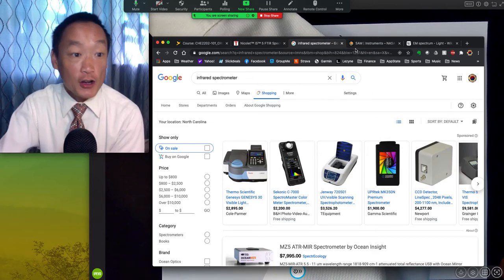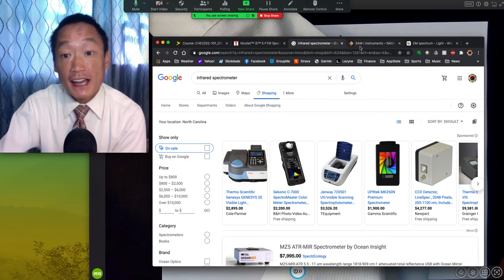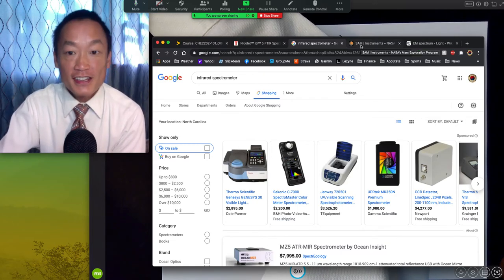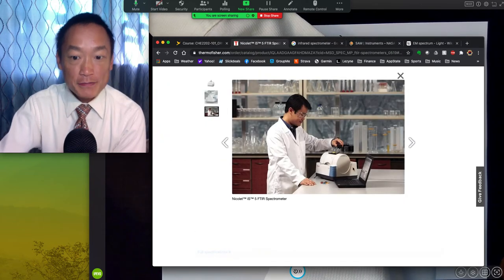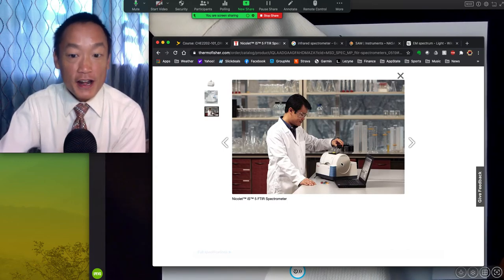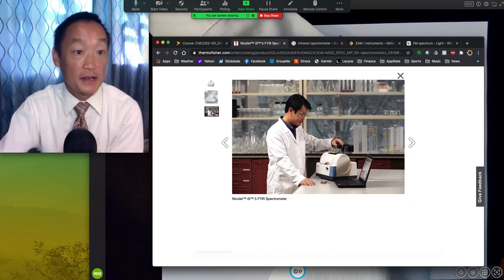And before I go into the details of what a spectrometer is and how the IR kind is used, I want to draw your attention to this. Here's a picture of this guy with this spectrometer. If this guy wanted to keep his job, he would never pick up this instrument, turn around 180 degrees and drop it on the ground. That is not something that would fare very well for this instrument.